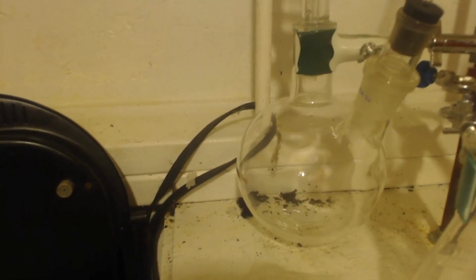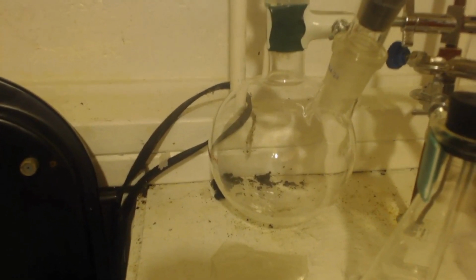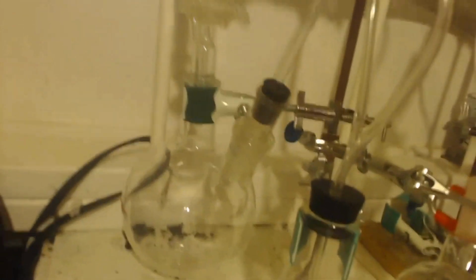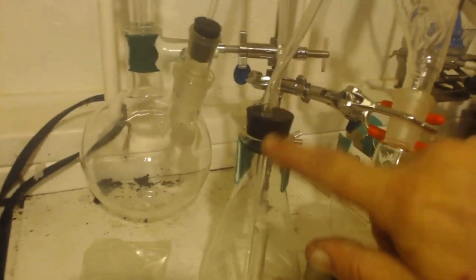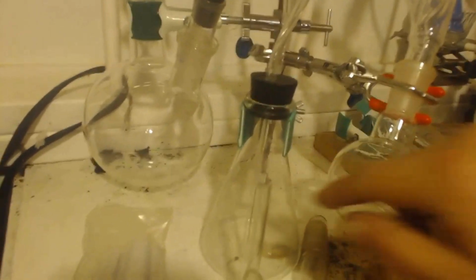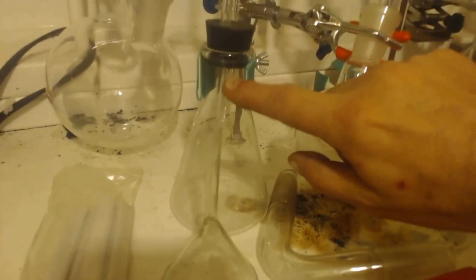Let's go over this part first. You got an equalizing funnel there. I'm going to put hydrochloric acid in. I'll drip it into this 2-neck round bottom flask, and that will have calcium hypochlorite. And you can see it comes out this tube down into this scrubber, and I'm going to put some calcium chloride anhydrous in there. That way the chlorine, you can see there's a tube inside here.